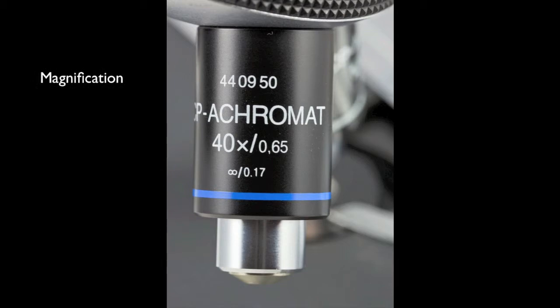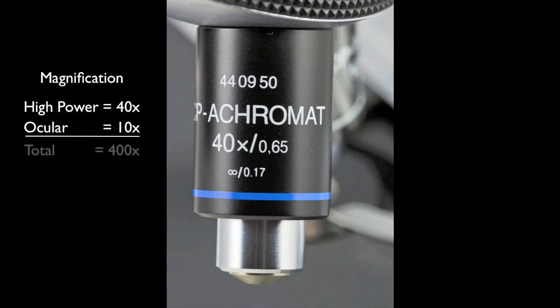This lens magnifies objects 40 times. The ocular magnifies the image 10 times. When using this objective, objects will appear 400 times larger than they really are.